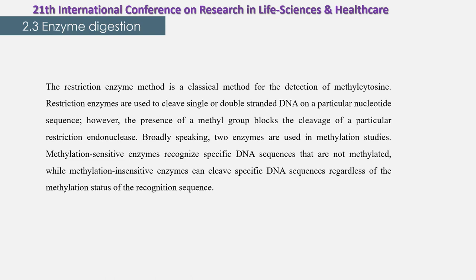The restriction enzyme method is a classical method for the detection of methylcytosine. Restriction enzymes are used to cleave single or double stranded DNA at a particular nucleotide sequence. However, the presence of a methyl group blocks the cleavage by a particular restriction endonuclease.